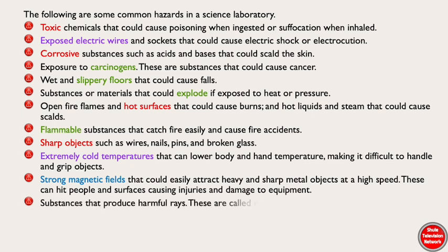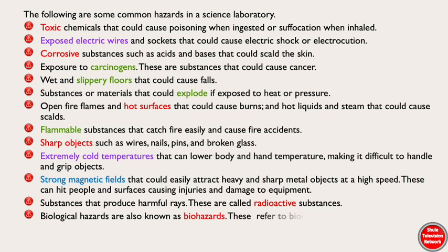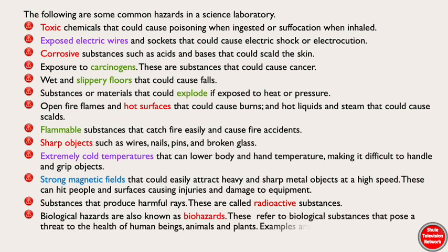Substances that produce harmful rays. These are called radioactive substances. Biological hazards are also known as biohazards. These refer to biological substances that pose a threat to the health of human beings, animals and plants. Examples are viruses, bacteria, and fungi.